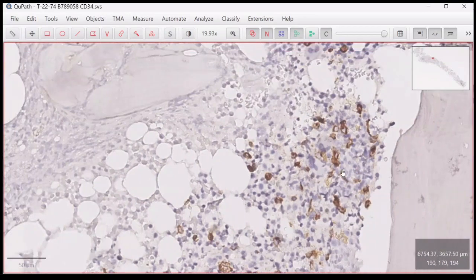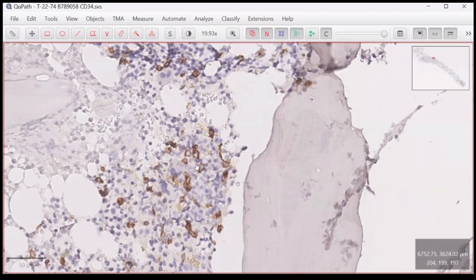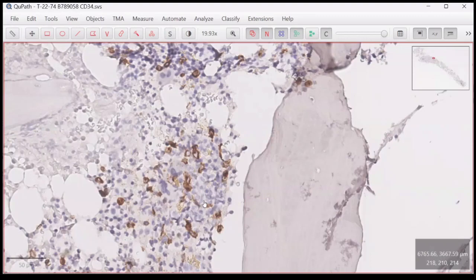And for this 34, you have to check with other markers, if possible TdT, because in post chemo, for example, you may get some hematogones, circulating hematogones.